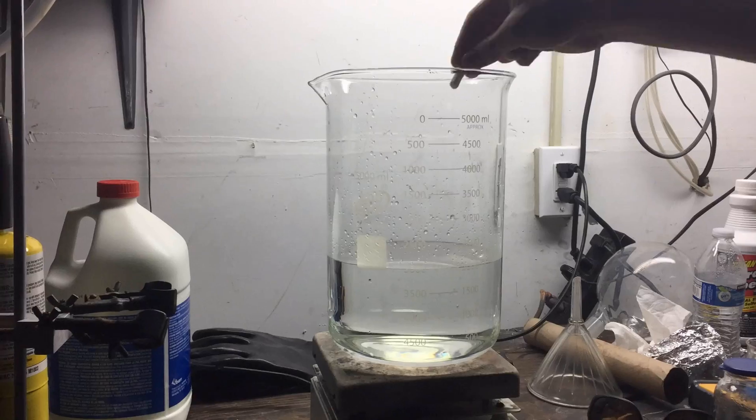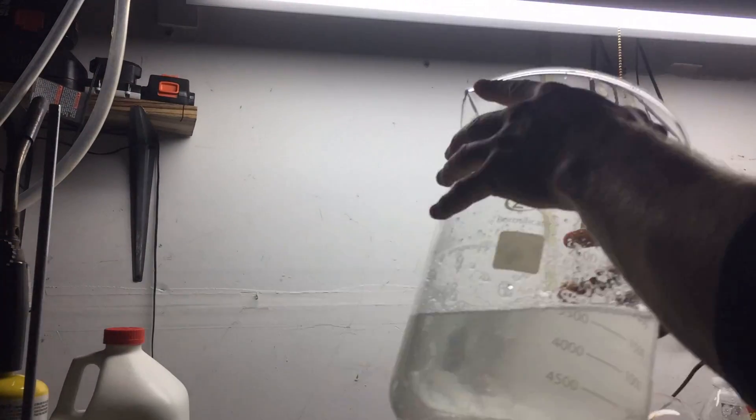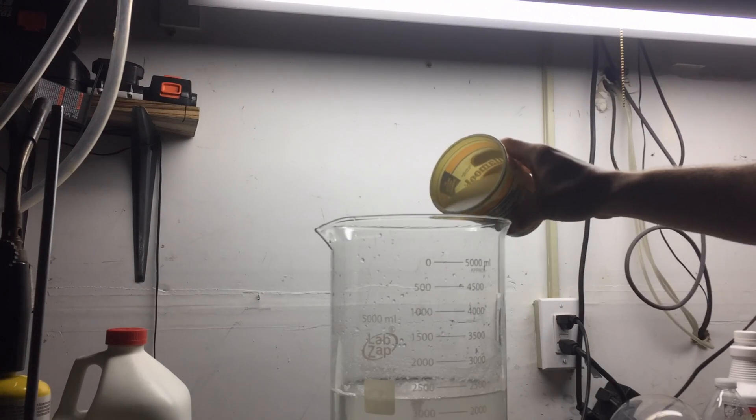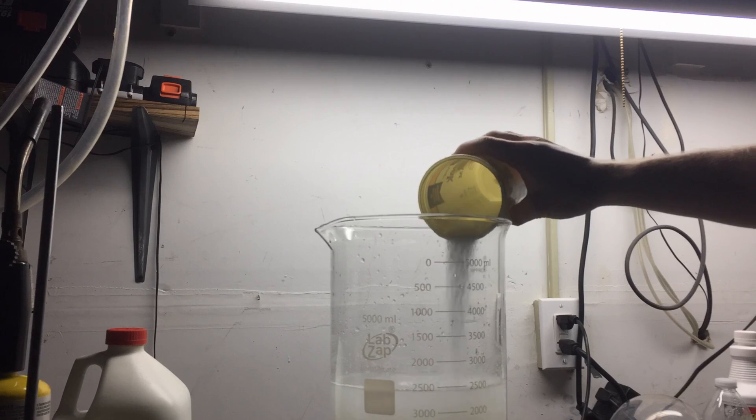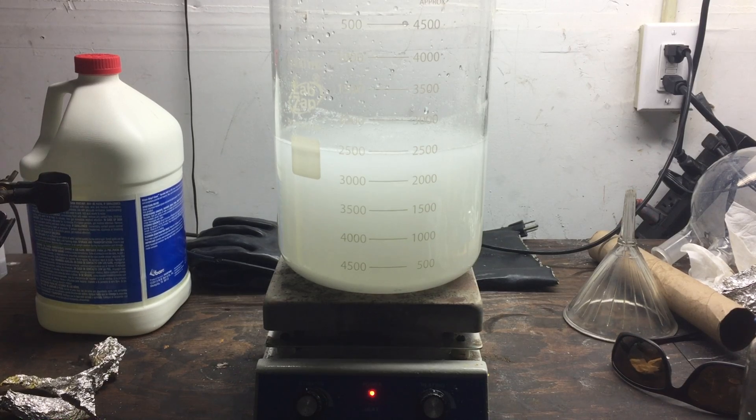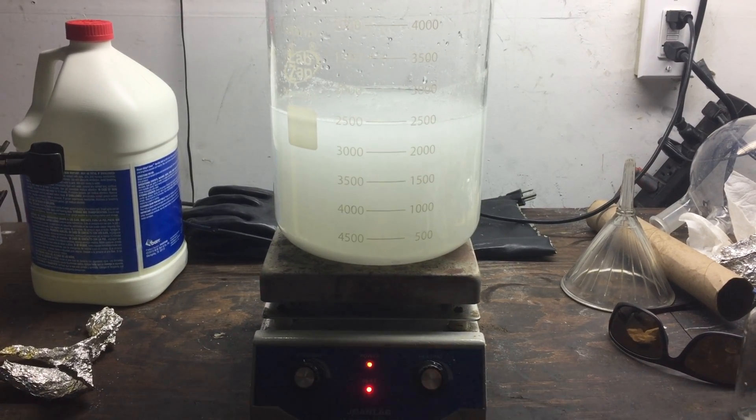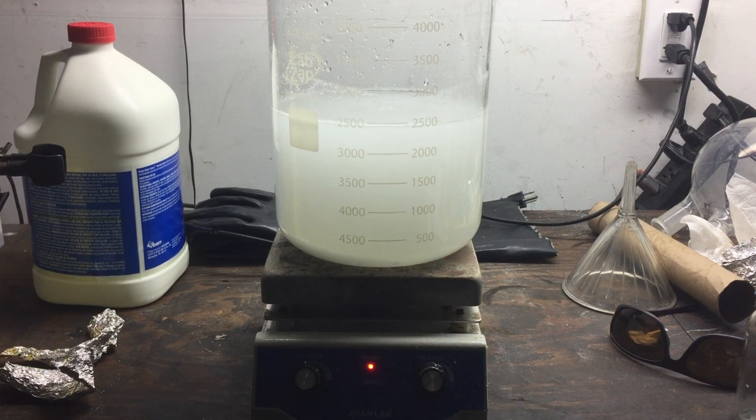Once everything was weighed out, I added all of the salts to about 2 liters of water, and I tossed in a stir bar. The stir bar was turned on, and it helped mix everything together and make sure everything got dissolved. You'll notice that the solution appears quite opaque, and initially I thought that this was due to undissolved salts, and so I started a light heating.